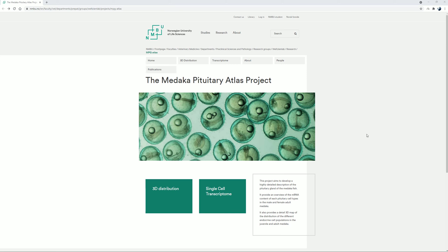On the previous video tutorial, we have seen how to browse the repository of raw data files and download one of them. So now we want to make a 3D view of this file in a specific imaging open source software called Fiji or ImageJ.